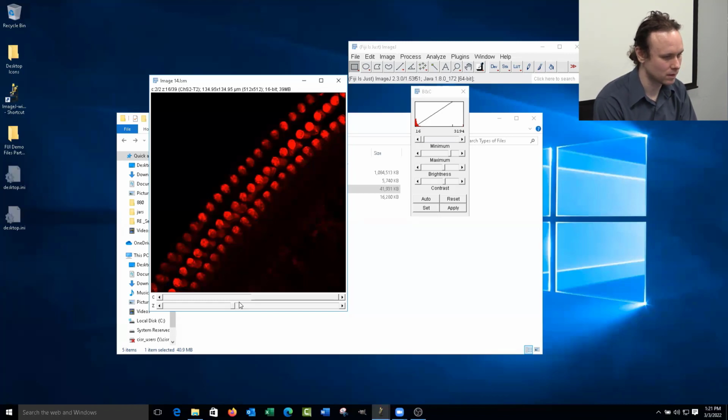Yeah, and I was going to elaborate on that from what Laura was asking too, and what Evan said. You're going to adjust your min and max, but it's not just how you feel that day. You need to have some data from a negative control or something to figure out what your background really is and what you're really capturing. You want to figure out what that background is from measuring something else and then set it for your actual test cases.